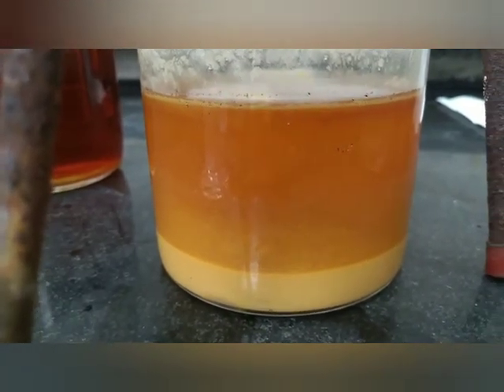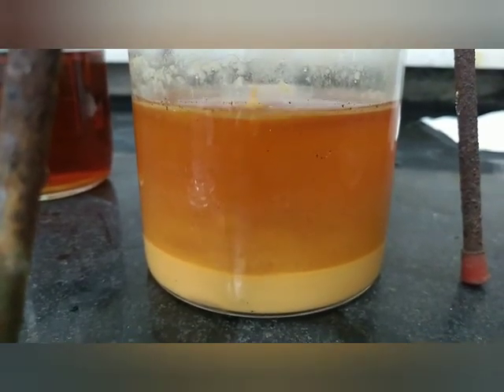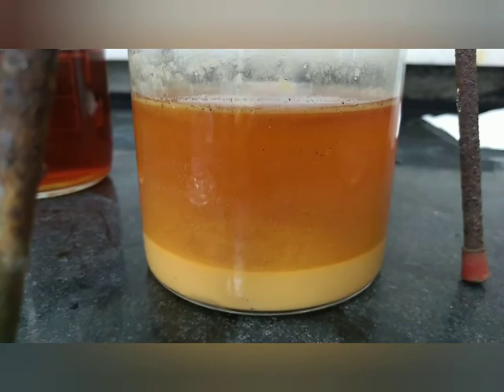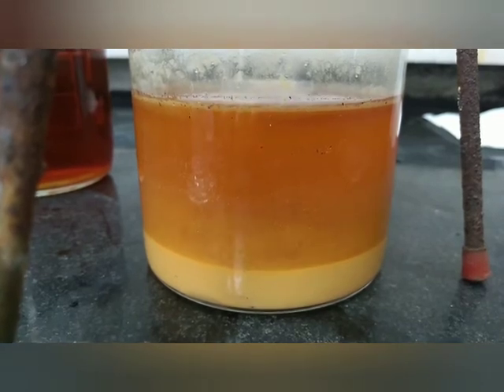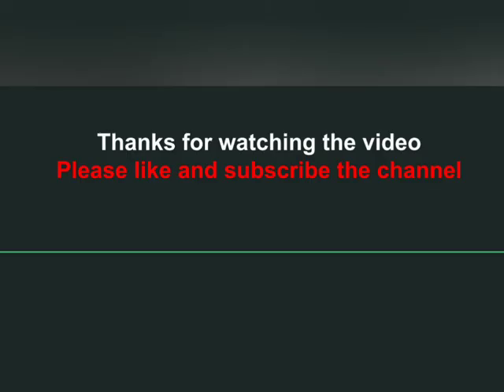You will get the yellow precipitate. Dry it in open air at around 60 to 70 degrees Celsius and you will get the yellow precipitate like this. You can further process it as per your requirement.